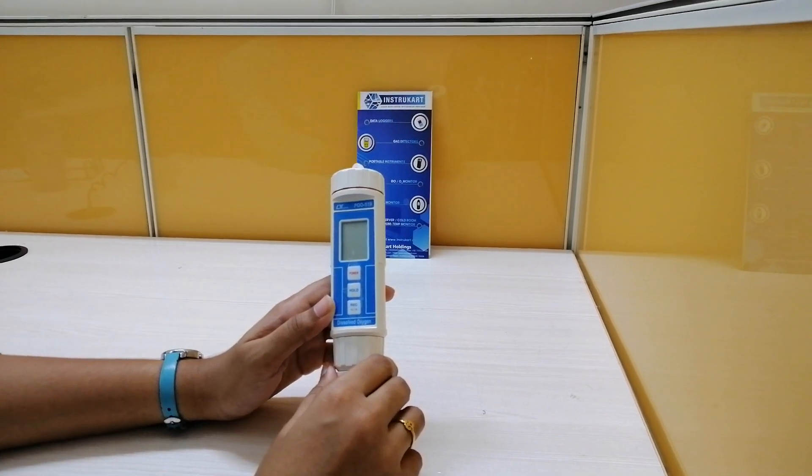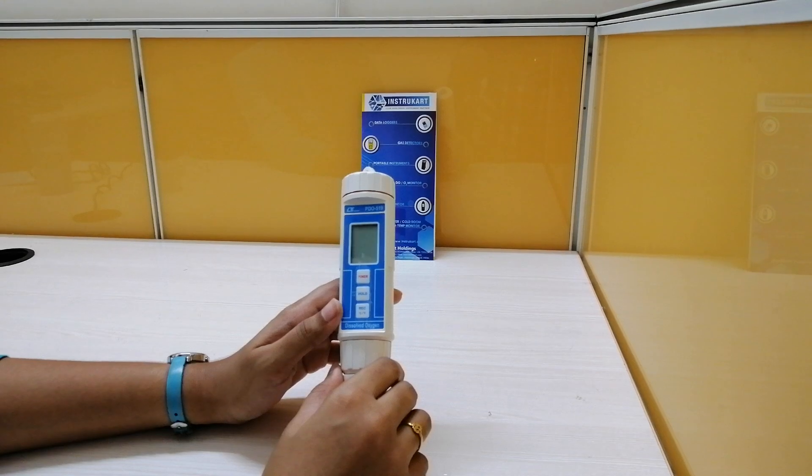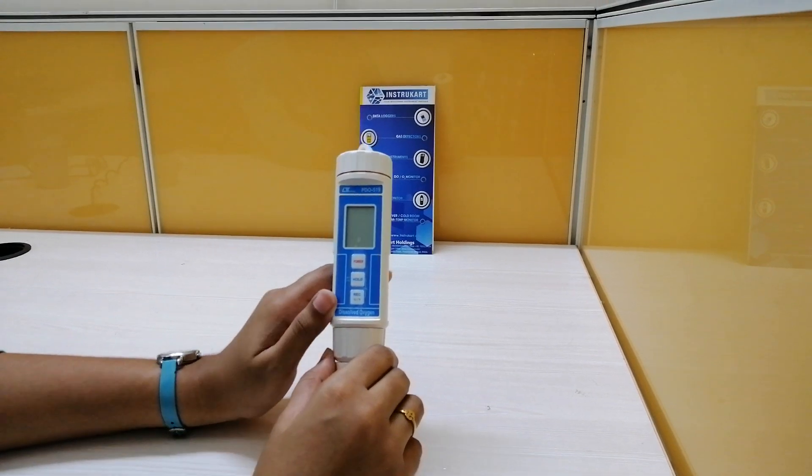Coming to the accuracies: dissolved oxygen is plus or minus 0.4 mg per litre, and oxygen in air is plus or minus 0.7%. Coming to temperature, it is plus or minus 0.8 degrees centigrade.